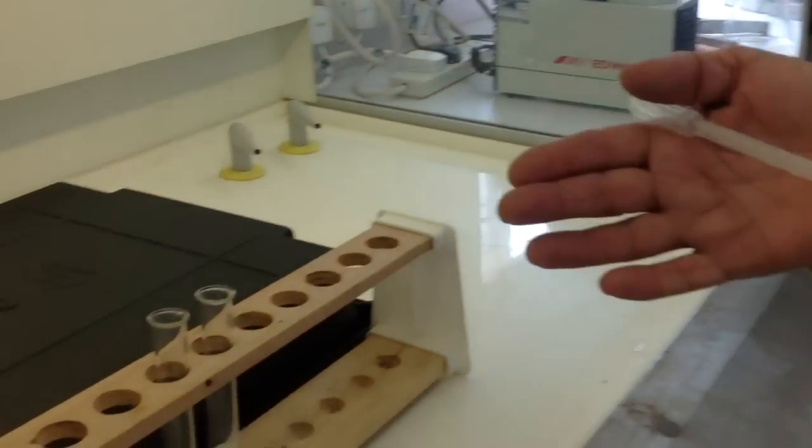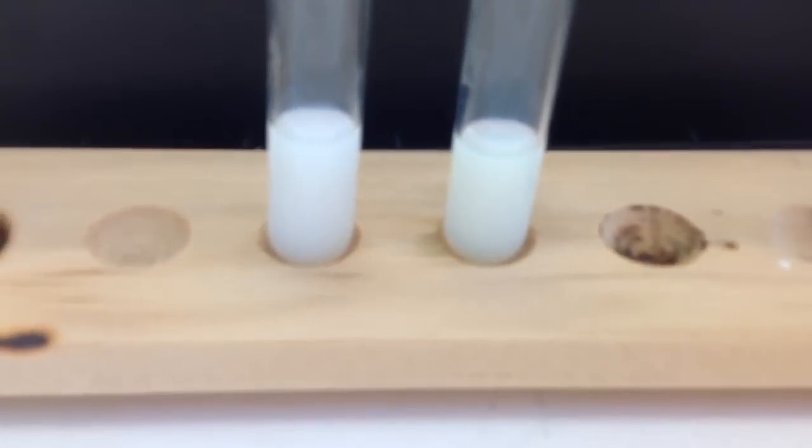I'm now going to move over to the fume cupboard for the next test, because we'll be using concentrated ammonia, and we're going to be adding it to the bromide and iodide precipitates. I'm going to turn on the fume cupboard, so you might not hear me now.